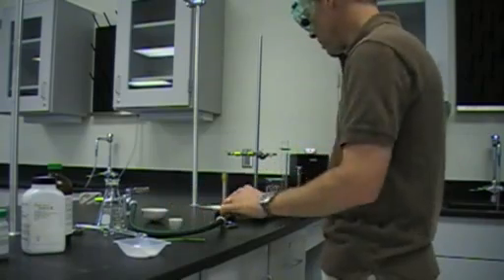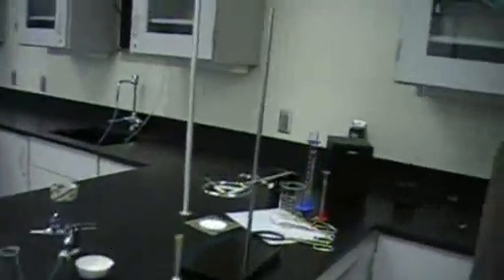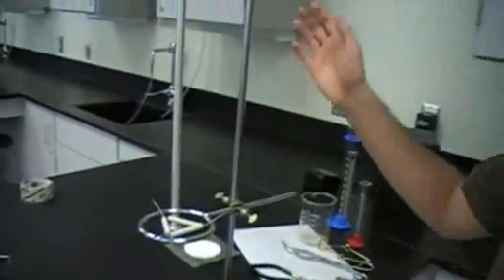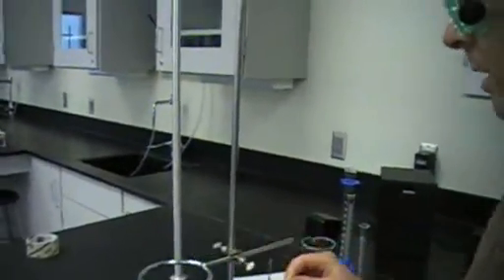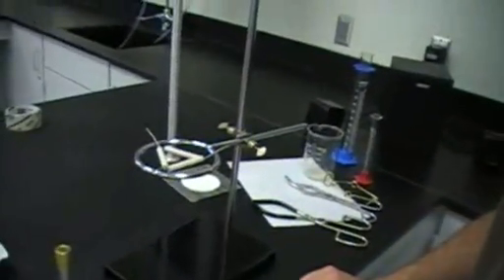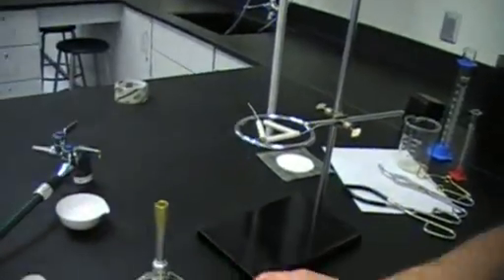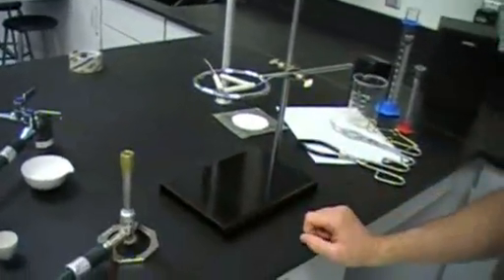And then the next thing is the apparatus I have set up over here. Several of these things you're going to see on your quiz. But this is a ring stand, the big tall thing. This is an iron ring. For obvious reasons, it looks like a ring and it's made out of metal. This is a triangle. And the triangle is used specifically with a crucible. I'll show you how that works in a second. And then we have Bunsen burner, gas, but really just you want to know the names of the equipment.